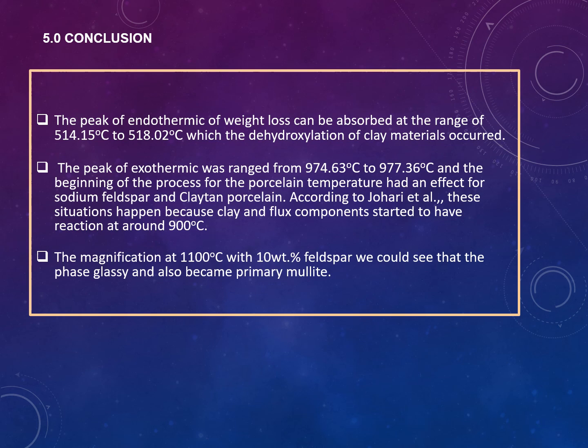And then at the same magnification at 1100 degrees with 10 weight percent feldspar, we could see the glassy phase and also primary mullite.